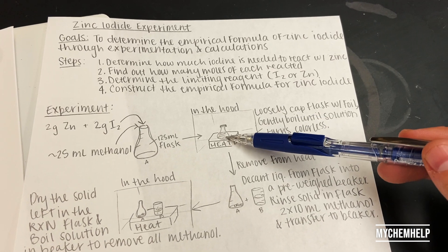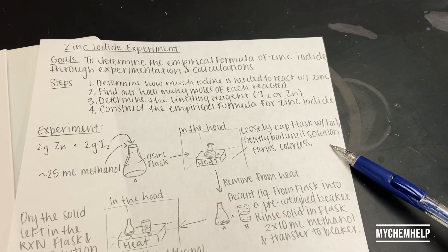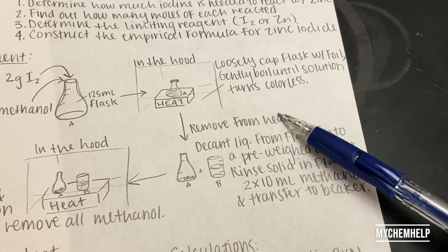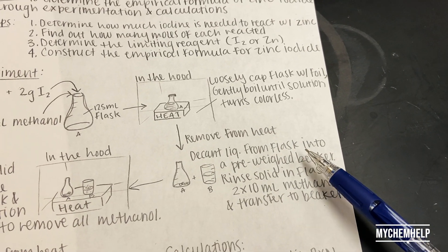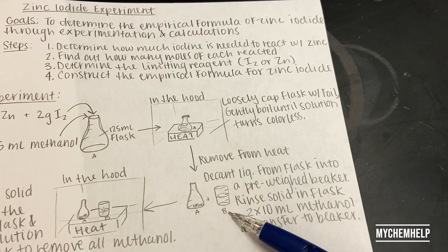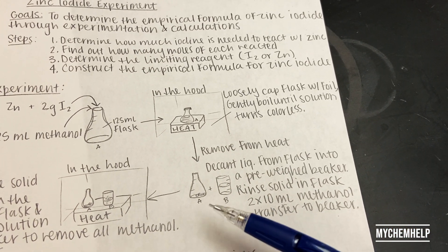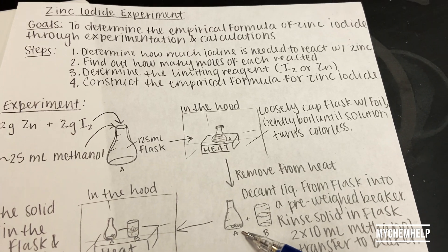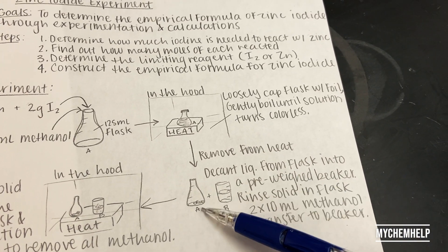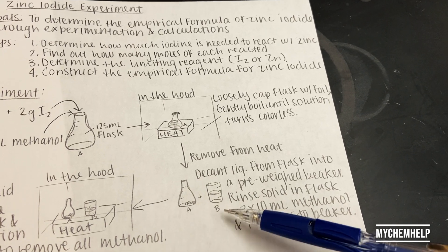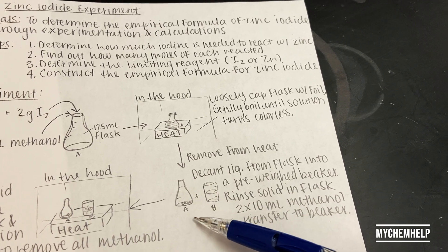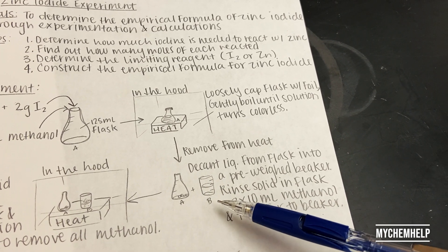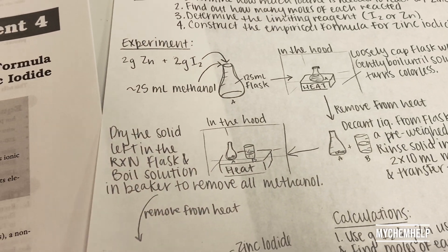You heat the solution, and you'll know the reaction is finished when the solution turns colorless. Next, remove from heat and decant the liquid from the original flask into a pre-weighed beaker. The solid left over will be the excess reagent — the opposite of the limiting reagent. Do a couple rinses with methanol in the flask and transfer that to the beaker as well.